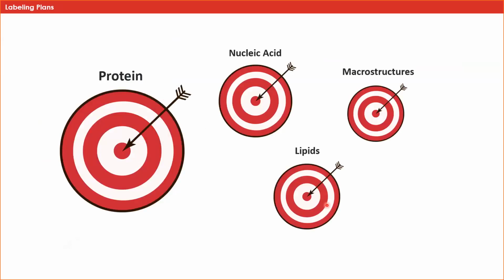By far, the main analyte target are proteins, with other targeted analytes including lipids, nucleic acids, and macromolecular structures using specific fluorescent dyes. You will want to check the compatibility of both the analyte and labeling agent with your method of choice. As another example, if you're using a dye that binds to lipids, you will not want to use a clearing method like a clarity-based method that removes lipids.